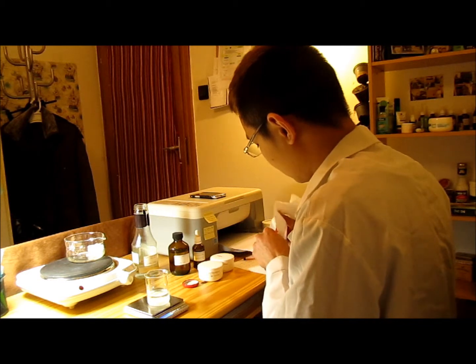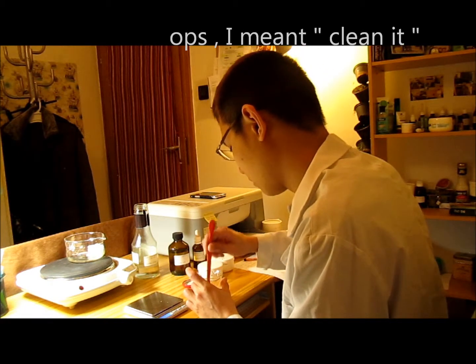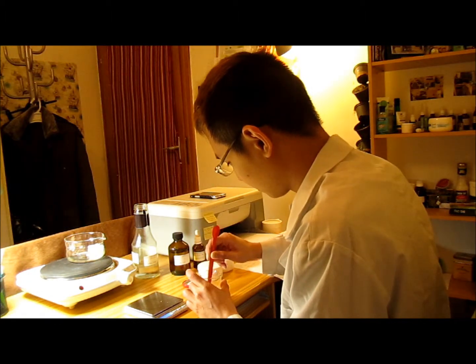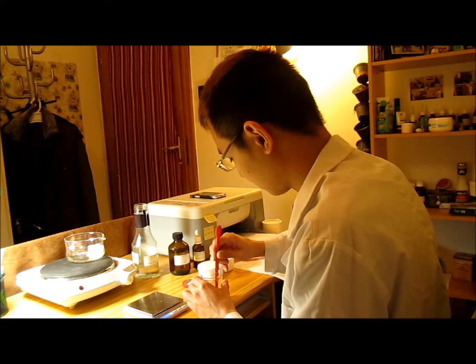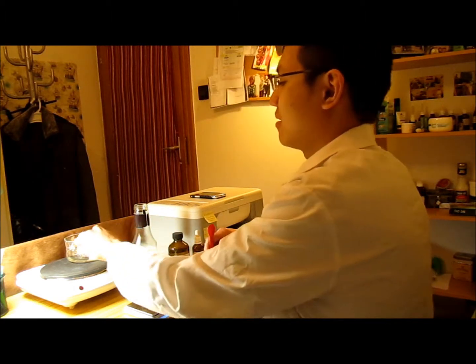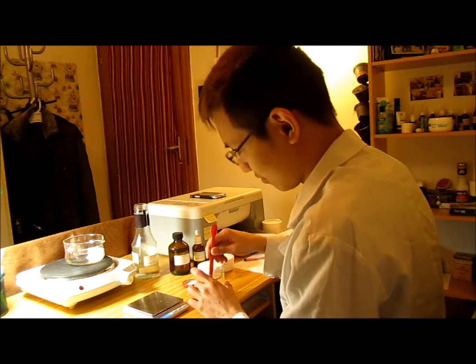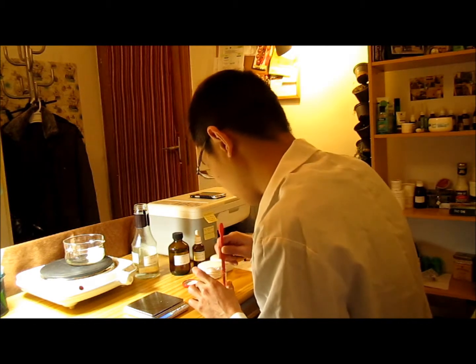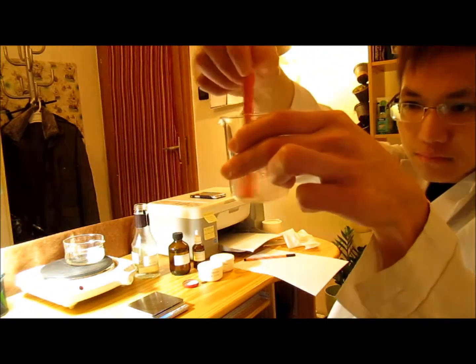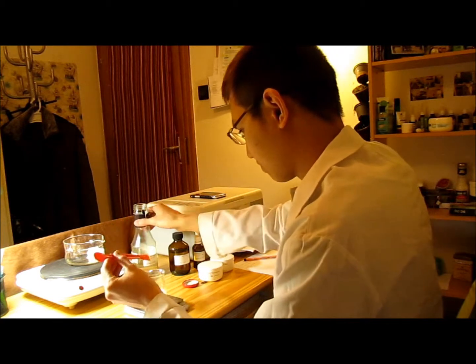It's okay to use the other side of the spoon if you've already washed it. Always mix away from the balance itself. As you can see, the base has been melted. It will take more or less 5 to 10 minutes for everything to dissolve. Meanwhile, we need to dissolve the urea in the lactic acid and water solution.